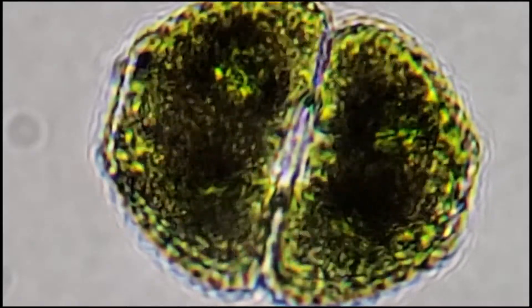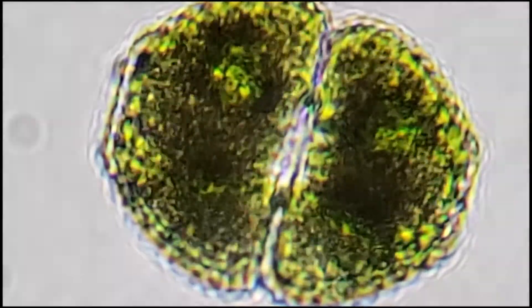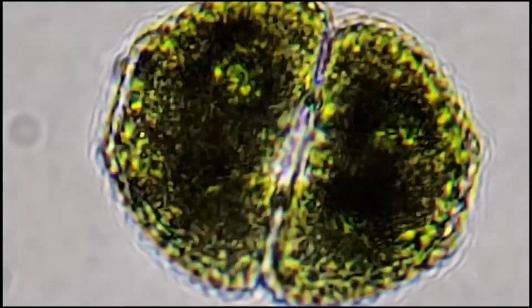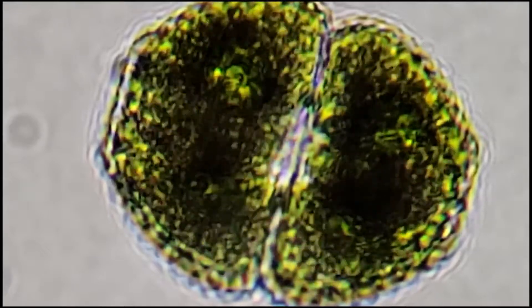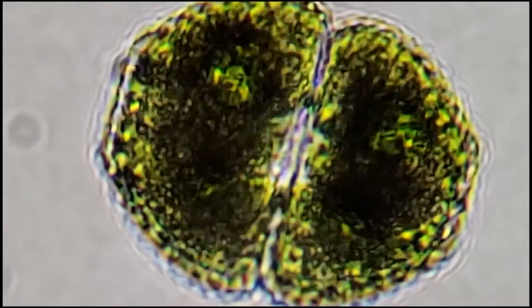What is it that is moving around inside of this organism? My first thought was that this must be bacteria, but my second thought was that it couldn't be, because it appears that this organism is still alive and intact.